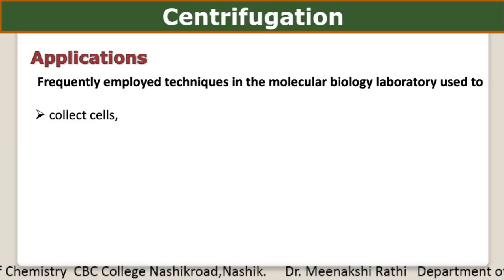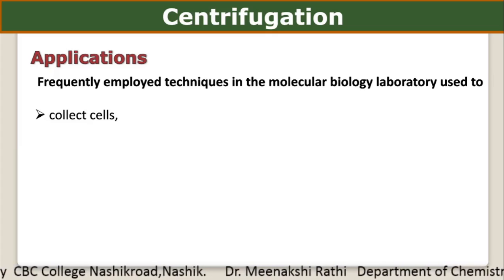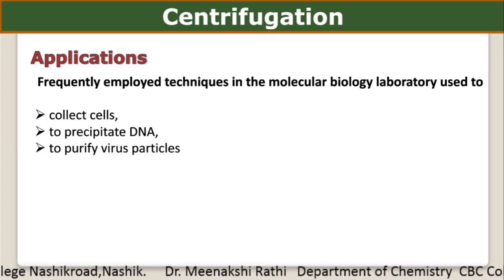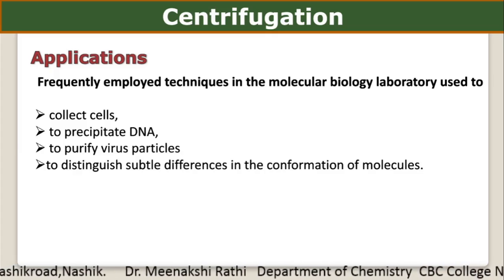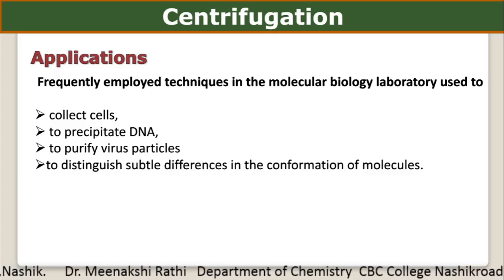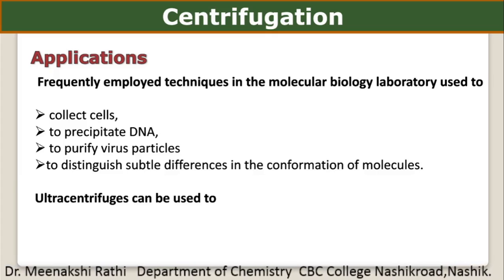It is used to collect cells, as I told you that in a pathological lab for some detection it is very essential to collect the cells, so that can be done by using centrifugation, to precipitate DNA molecules, to purify virus particles, to study the viruses, their purification is very essential, and to distinguish subtle differences in the conformation of molecules, which is not possible by simple methods, but by using centrifugation, the difference in the conformation of molecules can be identified.